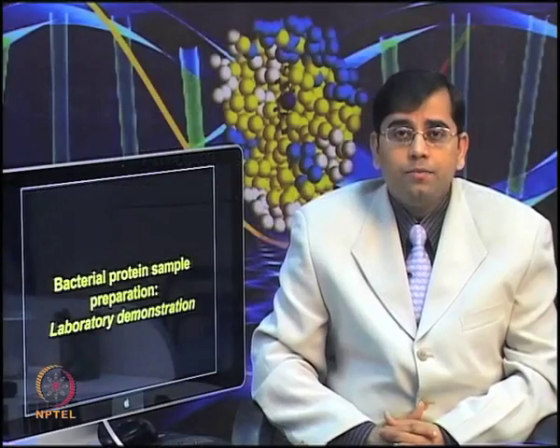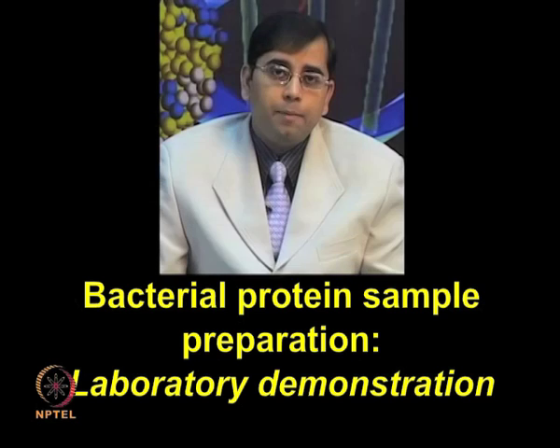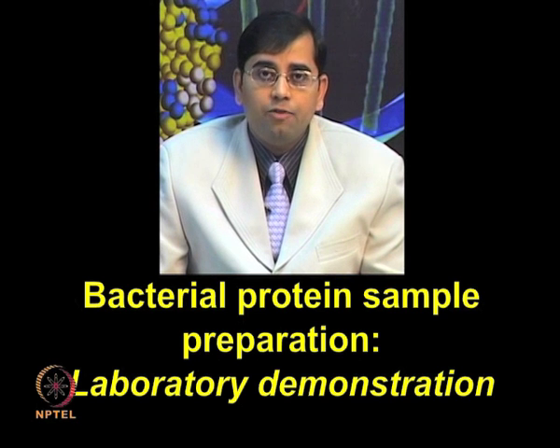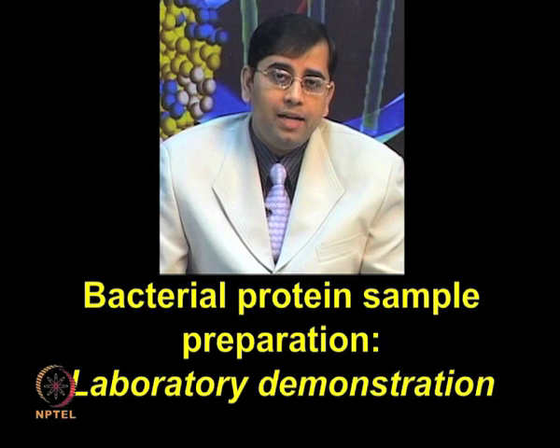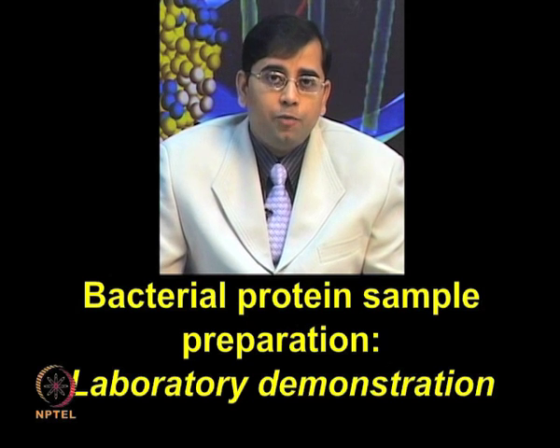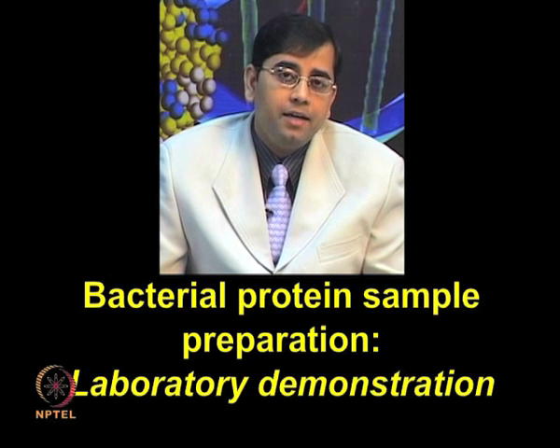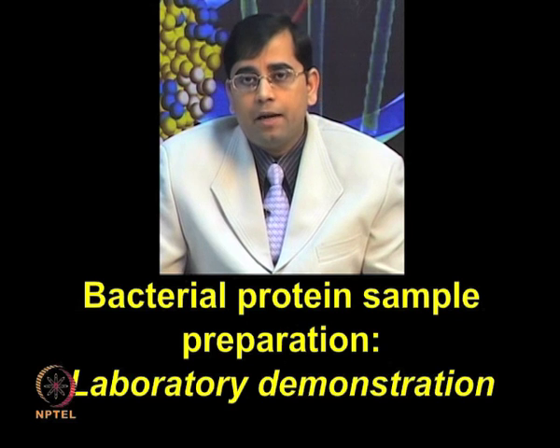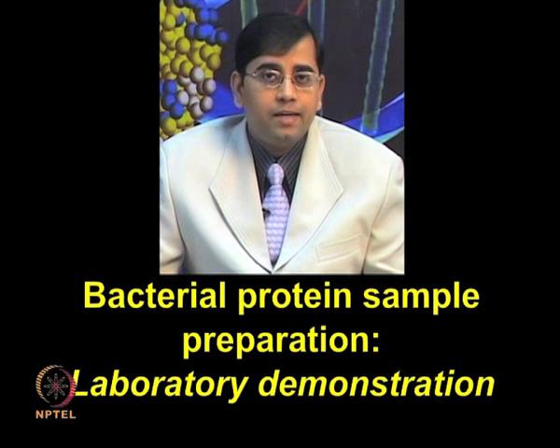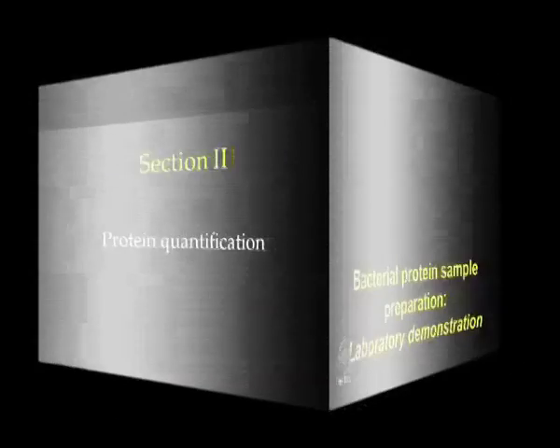Okay, so I hope this video was informative and now you are able to appreciate the complexity involved in this procedure, as well as how useful this method can be for different types of biomolecule extraction, including DNA and RNA, and how protein can get rid of various types of contaminants by using the Trizol method.